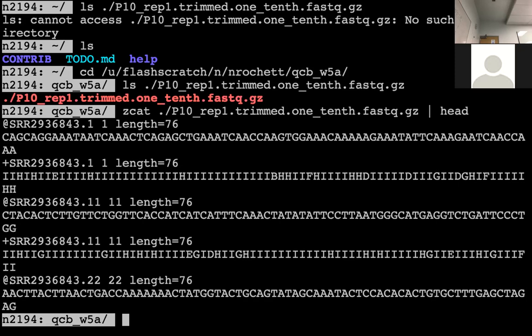Your scratch directory is already there. So when you run this, it will set it. You might even want to use 32 gigs if you want to open another terminal, because that might take longer. So open a new terminal and just start.